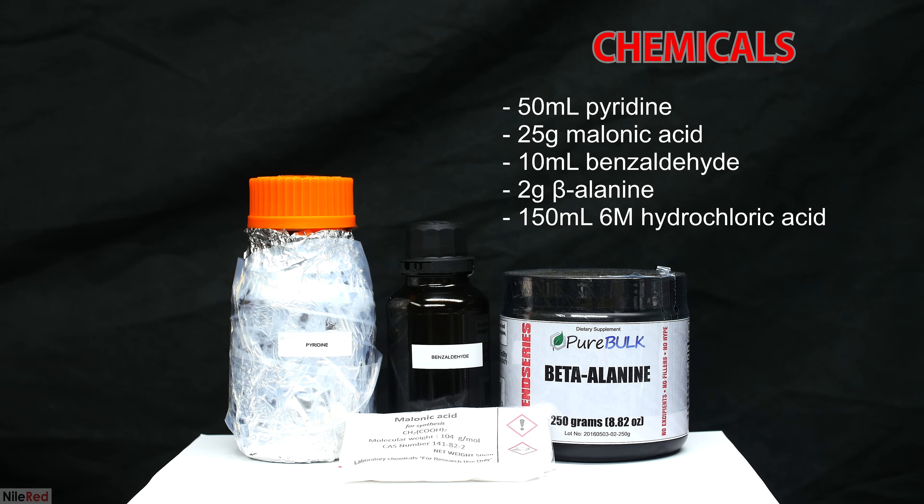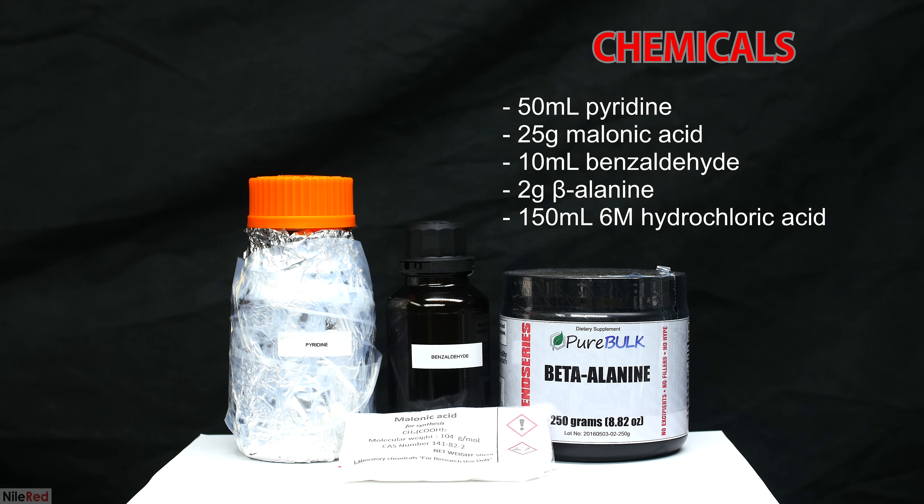Here are the chemicals that I used. From left to right at the back, we have pyridine, benzaldehyde, and beta-alanine. In the front we have malonic acid. In total I used 50 milliliters of pyridine, 10 milliliters of benzaldehyde, 25 grams of malonic acid, and 2 grams of the beta-alanine.